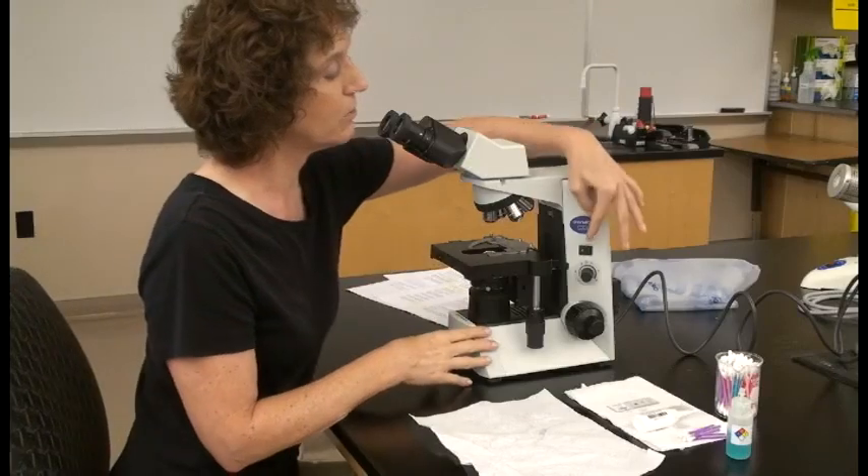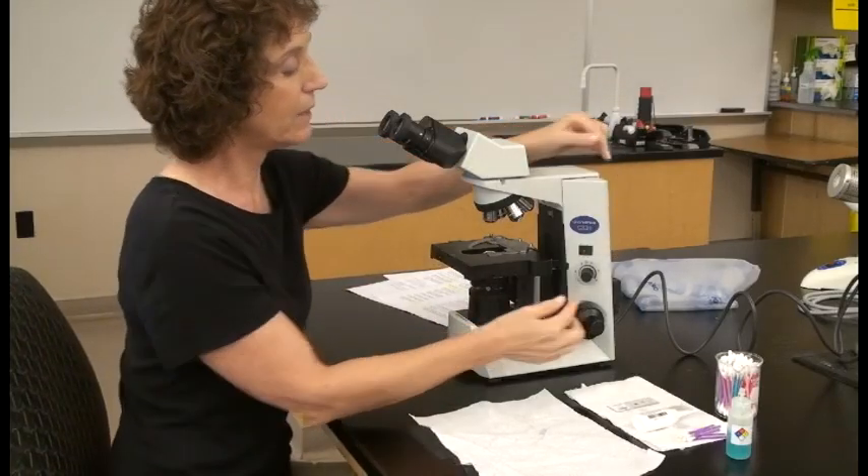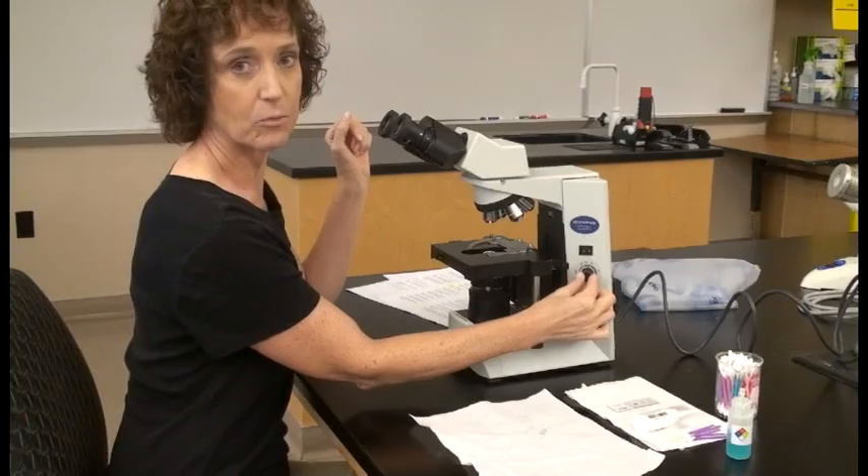Now we want to have some light going through this, so we're going to turn on our main switch and then increase the intensity of the light using the rheostat.